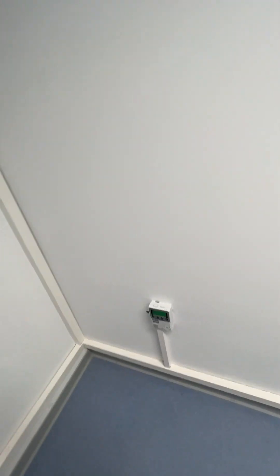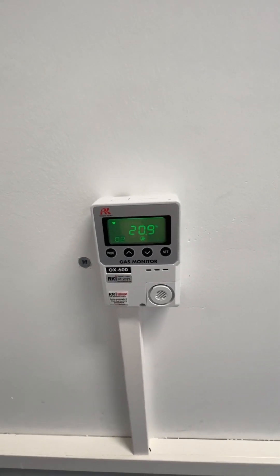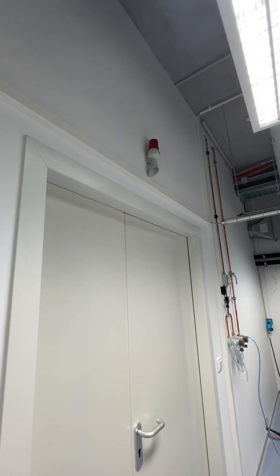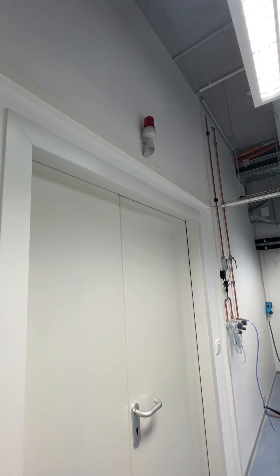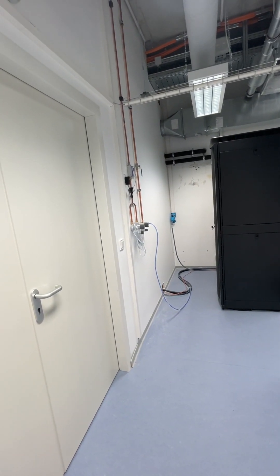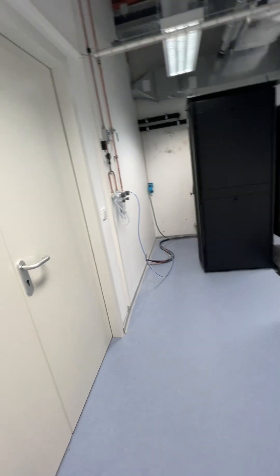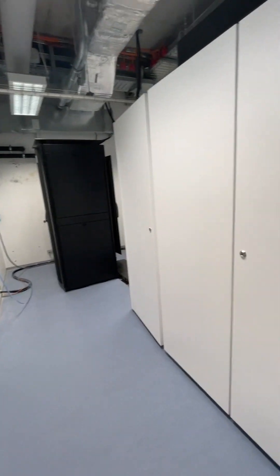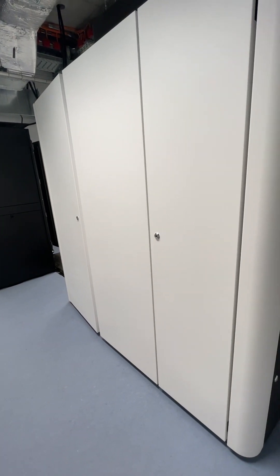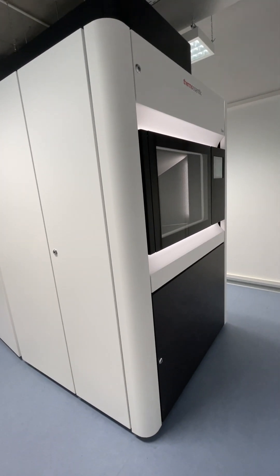They installed an oxygen detection system earlier this week. There are two sensors — one here and one on the opposite side of the room — and if oxygen levels get too low, an alarm sounds and a light flashes. There's also one out in the hallway. It'll sound at different thresholds, so you won't hear it and immediately be suffocating. It's usually not an issue, but because the room is confined, they installed it. Germans are very safety oriented, so it's not a bad thing.